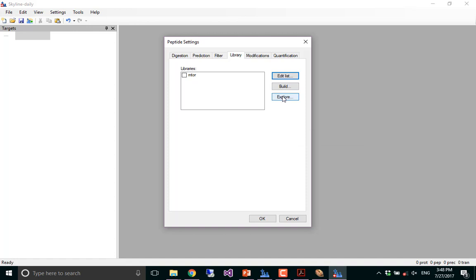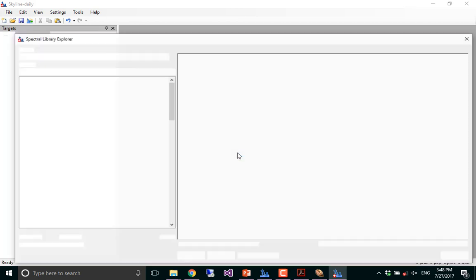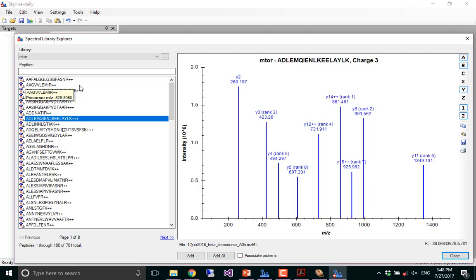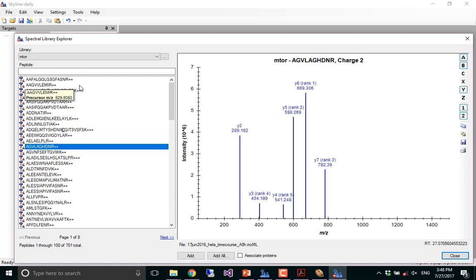Good. All right, now let's take a look at this file. I guess I should save it. Okay, so this is what the results from Pecan actually are. So these are the different peptides and their representation here. Some of them have a lot of peaks, and some of them don't have very many peaks. But these peaks are the ones that Walnut has decided are the best representation for that peptide. They have the right shape, peak shape, to fit that particular peptide. Okay?